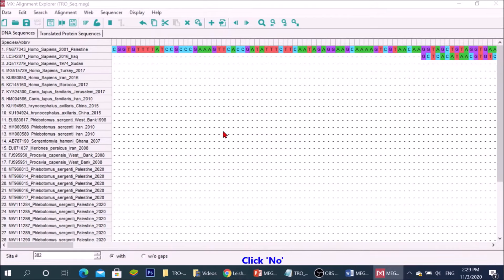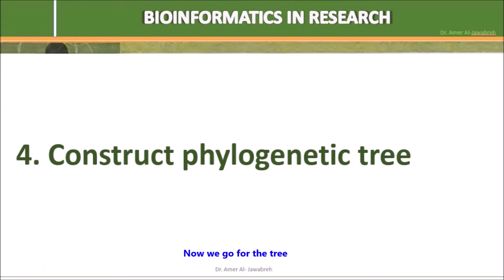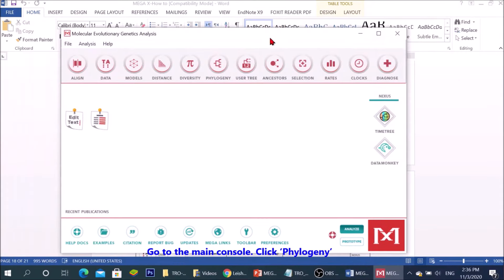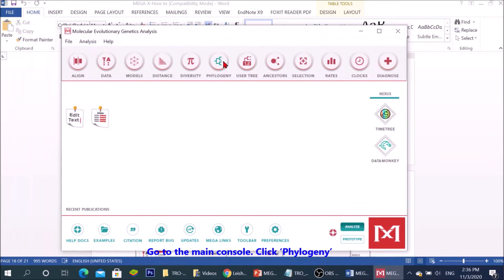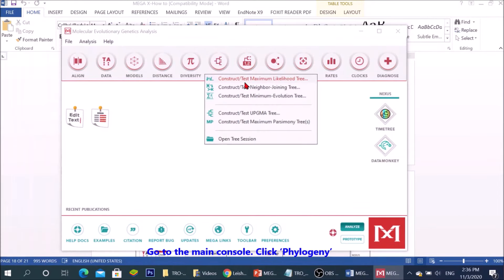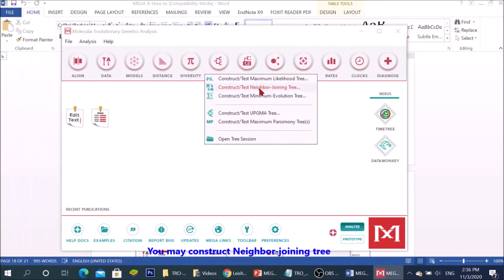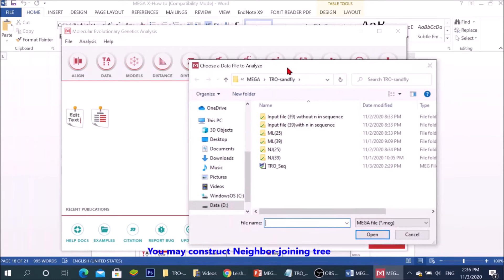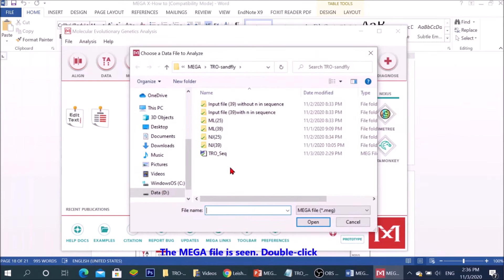Click no. Now we go for the tree. Go to the main console, click phylogeny. You may construct neighbor joining tree. The mega file is seen. Double click.